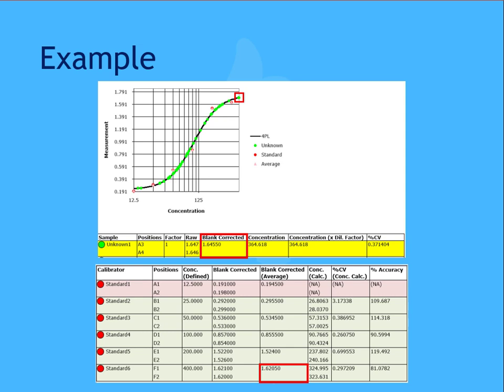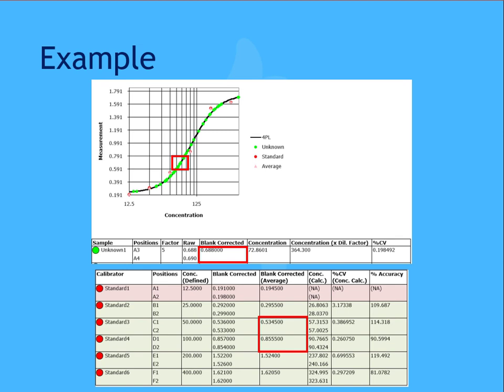So we want to reanalyze this data because now the blank-corrected value does fall within the range of the standards, and we're looking to confirm our previously received concentration result of approximately 365. So reviewing the updated values for unknown 1, you can see the new blank-corrected value, or y-axis value, falls well within the reportable range of the curve in standards. Looking at the curve, you can see the range in which unknown 1 falls is essentially in the middle of the standards, with that blank-corrected value being between standards 3 and 4.